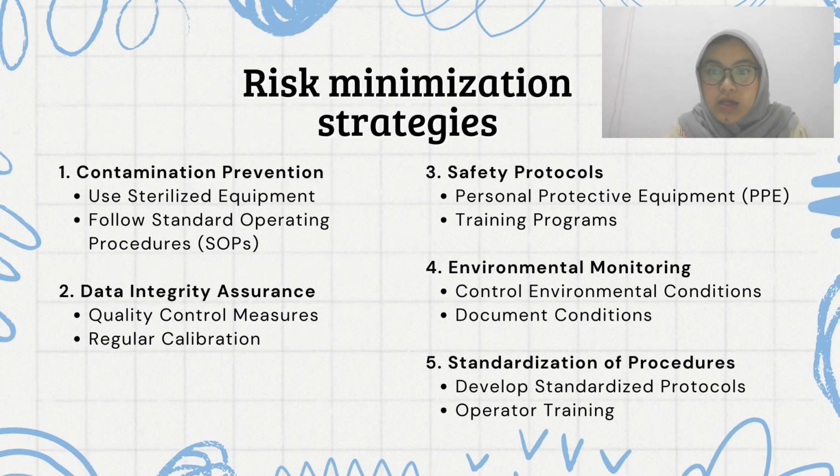And next, risk minimization strategy. 1. Contamination prevention: use sterilized equipment, and follow standard operating procedures, or SOPs. 2. Data integrity assurance: quality control measures, and regular calibration. 3.